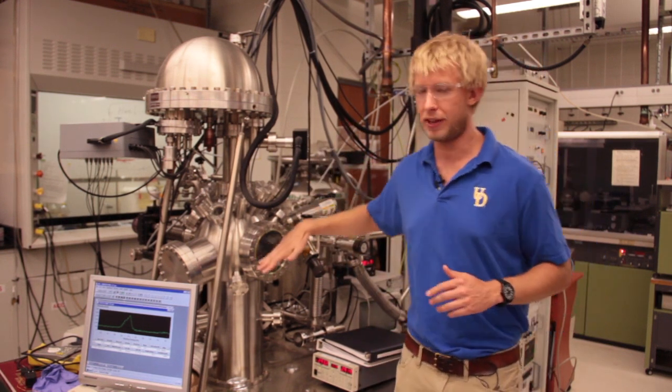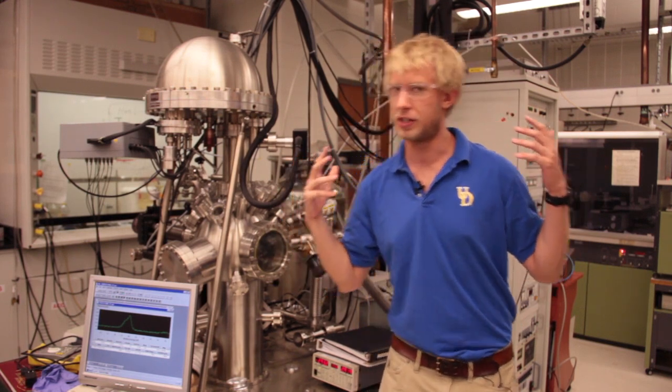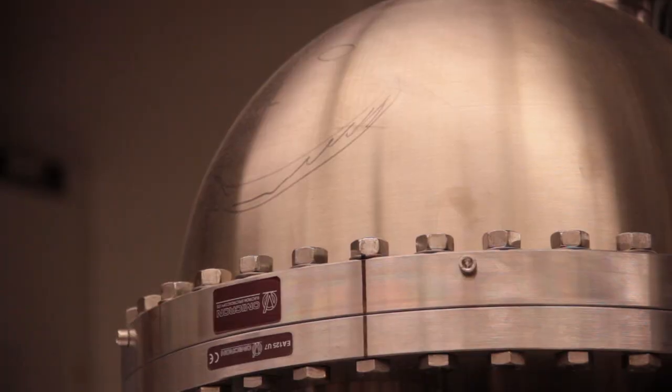So these X-rays come in and they knock off our electrons. The electrons go shooting off in all directions, but we have a lot of electrons come shooting up this tube.